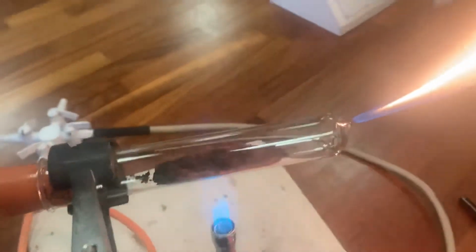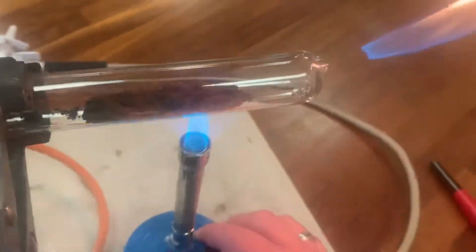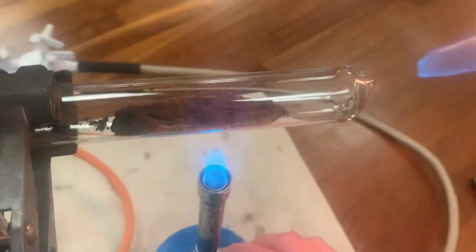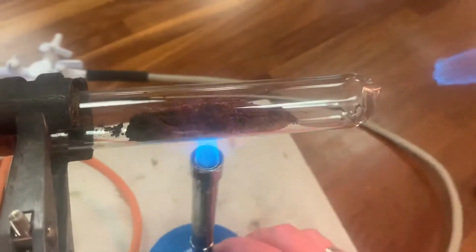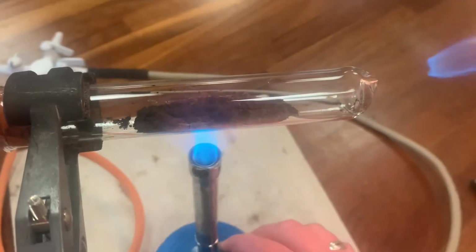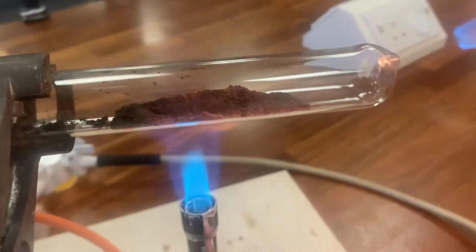So I've brought the camera around this side of the apparatus so you can have a look and see what's happening inside the test tube. So remember, it started off as a black solid, and as I heat it, it started to change colour. So hopefully you'll be able to see now in the camera that there's a different colour inside the test tube. You might see an orangey brownish colour inside the test tube. I'm going to heat it for another minute or two and then we'll tip it out onto the safety mat for you to have a look at. So have a look for signs that a reaction has happened inside the test tube.